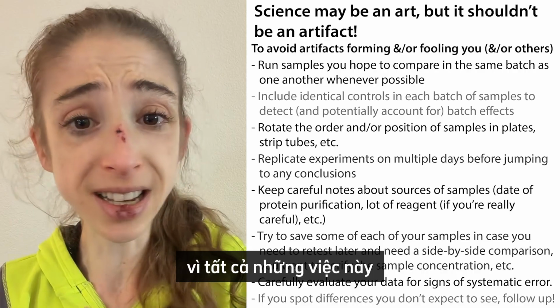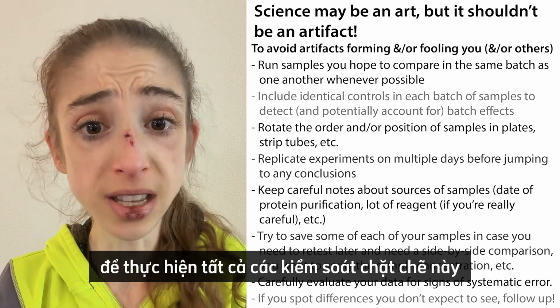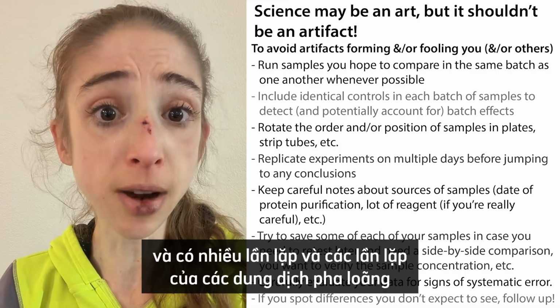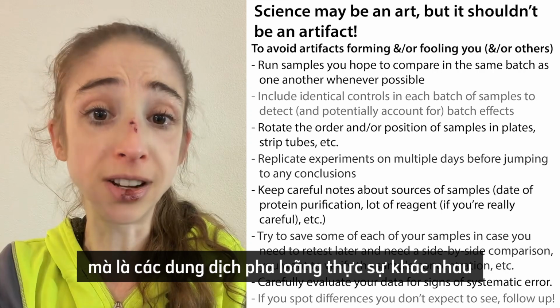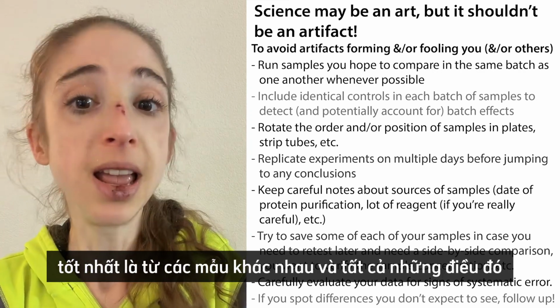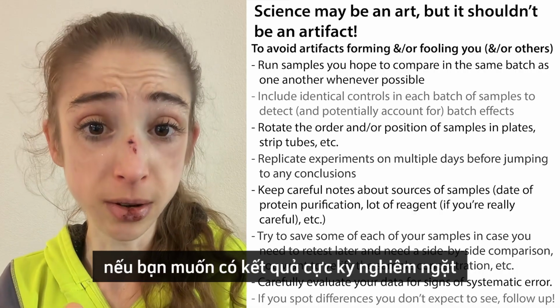And so all of these things are going to take significant amounts of time, effort, and money. It's not always practical to do all of these really tight controls, rotating samples, and doing everything in high replicates and replicates of your dilutions, not just technical replicates from the same dilution, but actual different dilutions, preferably from different samples. But that's really what you need if you want to have super rigorous results.